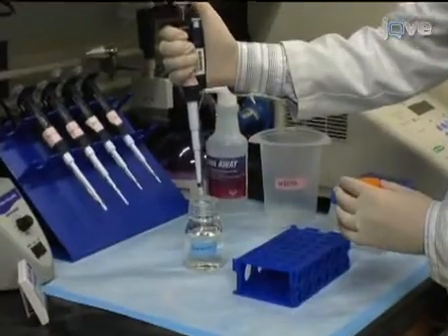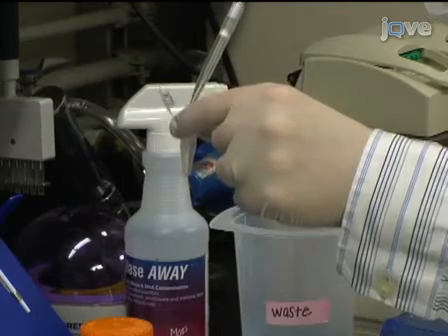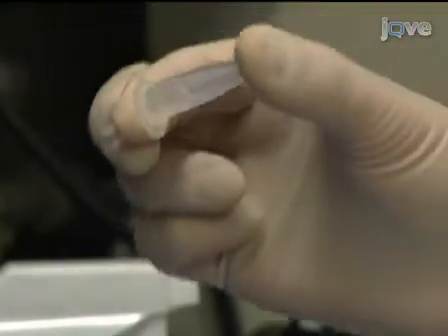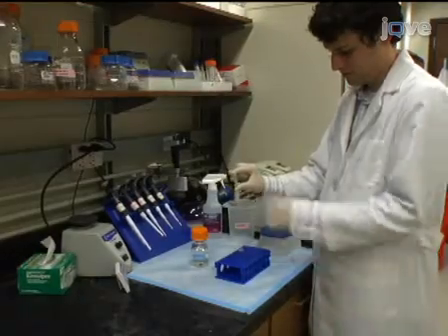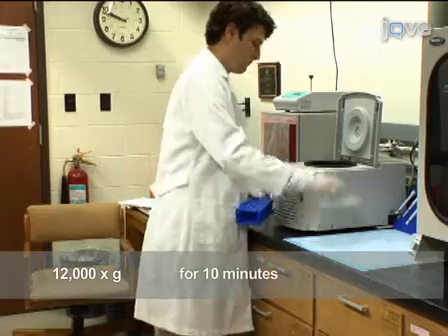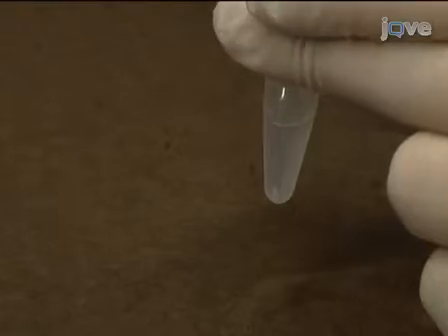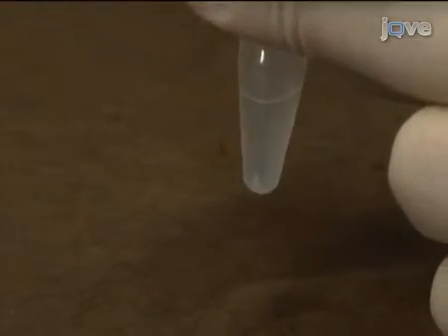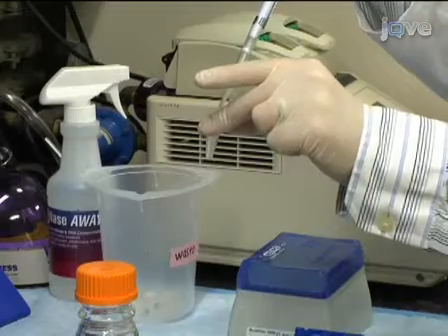Next, to precipitate the RNA, add 0.5 milliliters of isopropanol, mix, and let sit at room temperature for 10 minutes. Then centrifuge the sample at 12,000 g for 10 minutes at 4 degrees Celsius. The RNA should form a gel-like pellet. Remove the supernatant without disturbing the pellet and wash by adding 1 milliliter of 75% ethanol.